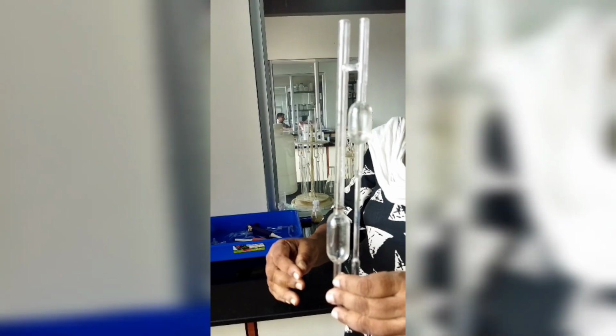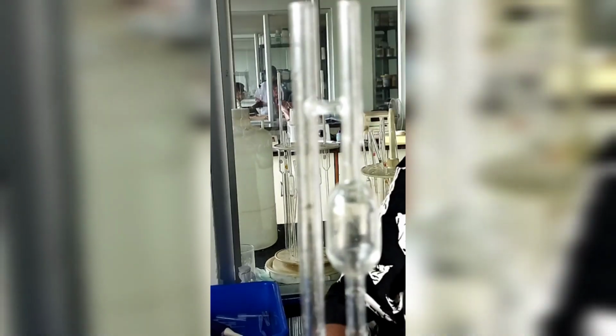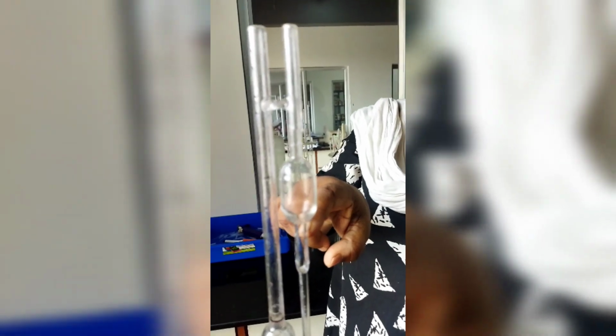So first we have to fill this up with the fluid. Then using suction at the top end, we have to draw the fluid up. The main thing that we have to measure is the time required for the fluid to flow from this point to this point. There are 2 distinct marks.